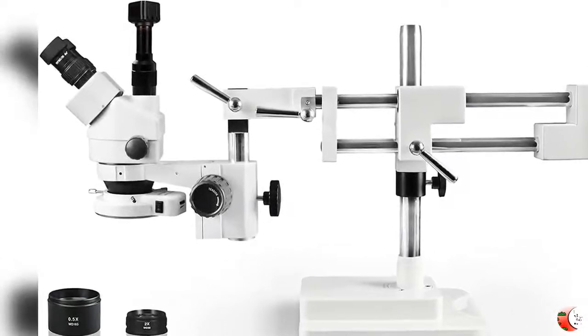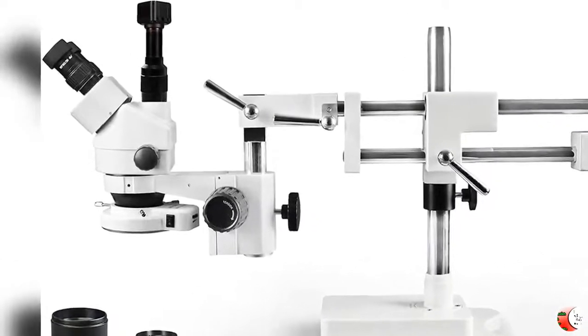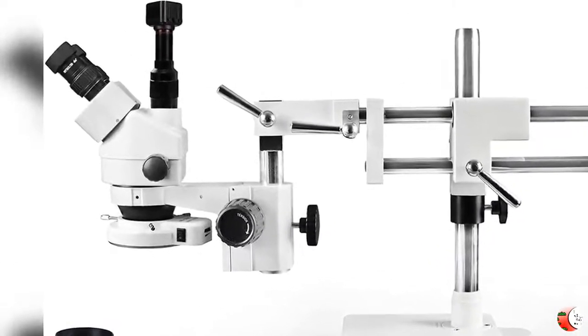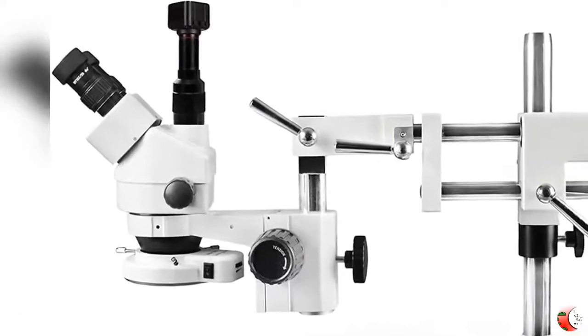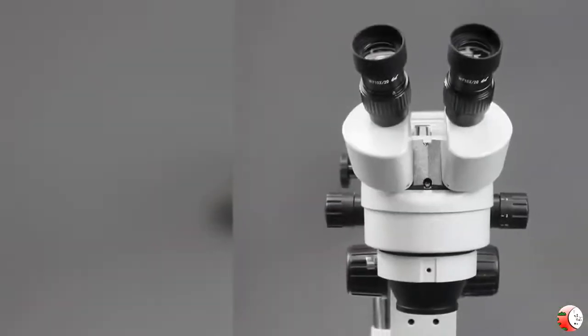3. 5-megapixel Wi-Fi Camera allows you to stream a high-resolution image directly to your Wi-Fi-enabled devices. Includes user-friendly imaging software.